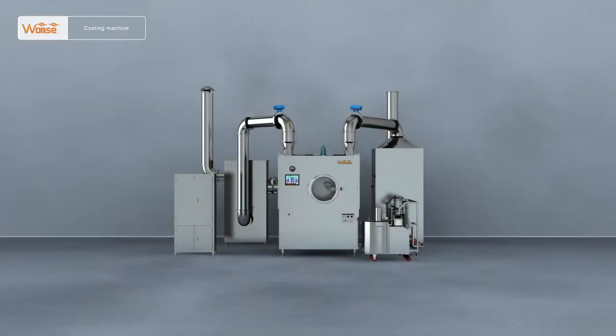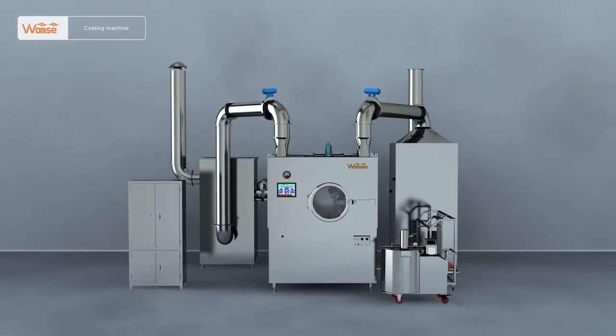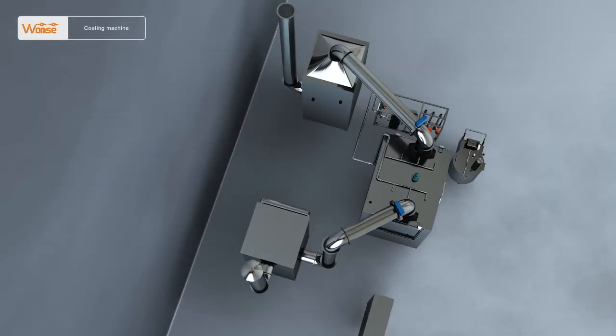Installation of coating machine. First, carefully adjust the anchor bolts and the base to level the main machine, hot air cabinet, and air exhaust cabinet, and ensure equal force bearing of all feet.